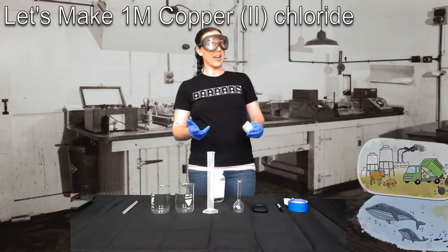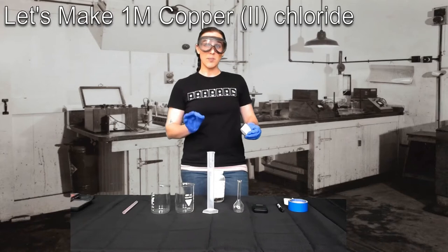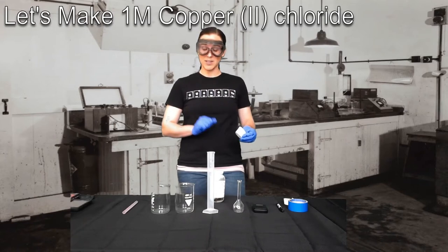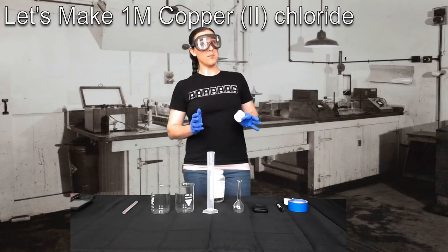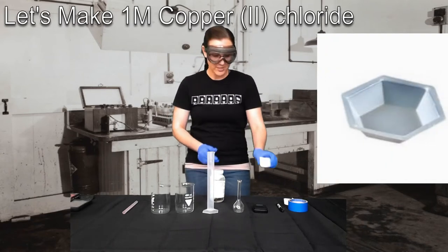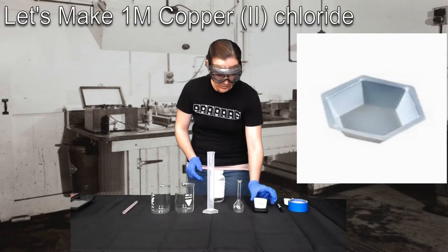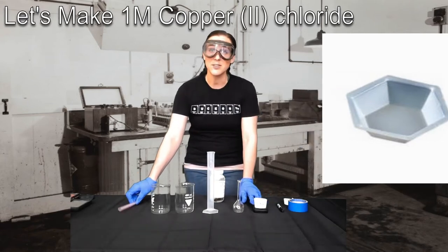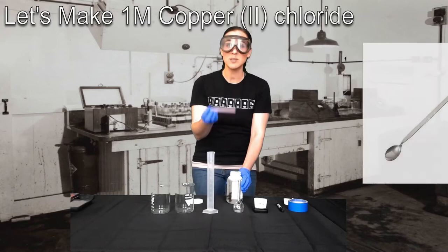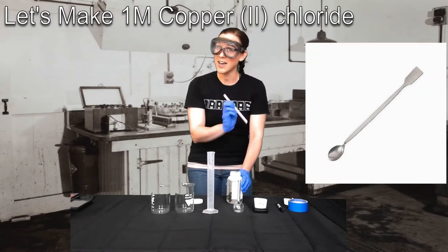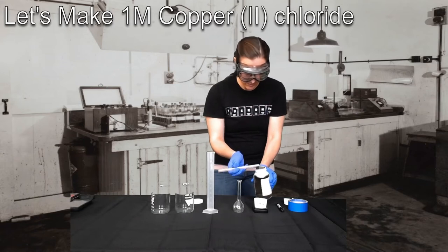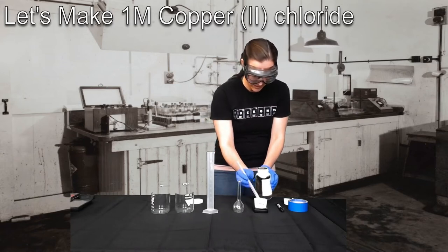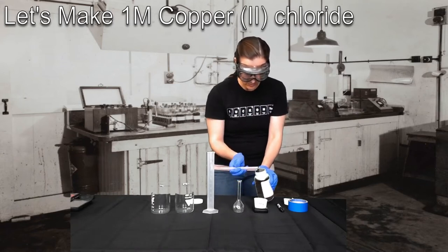As we found out in our calculations, we need to measure out 7.975 grams of CuCl2 in order to create 50 milliliters of a one molar solution. So this is my makeshift weighboat for measuring out the CuCl2. I'm just going to zero that on my scale here. And here is my makeshift scupula, a boba straw. And we're going to mass out 7.975 grams of CuCl2.